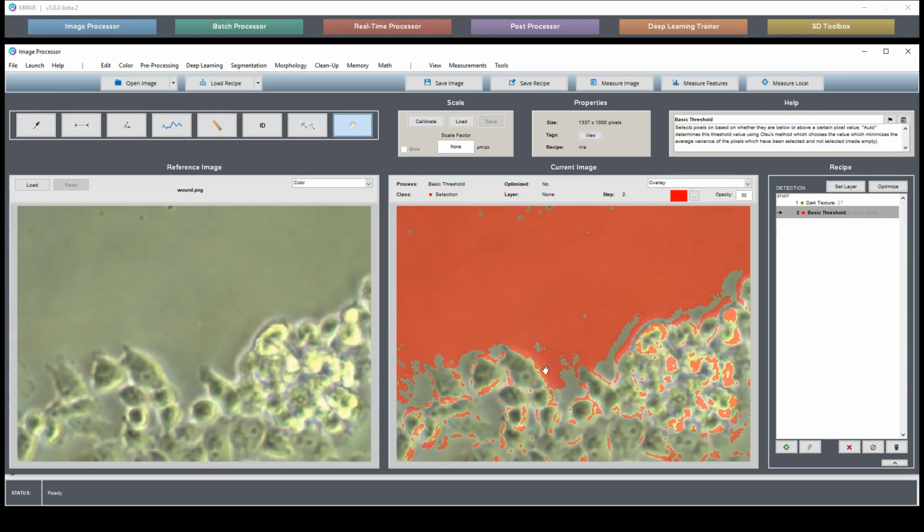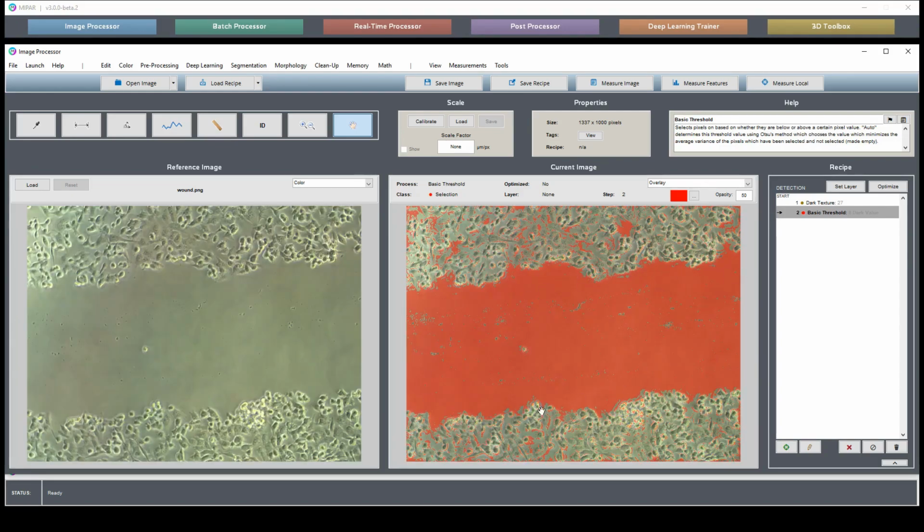So perhaps you want to find the bright of this particular cell. Okay. For the purposes of this assay, that little bit of error isn't going to be an issue, but for the sake of argument, say you had an experiment where that level of accuracy was necessary.